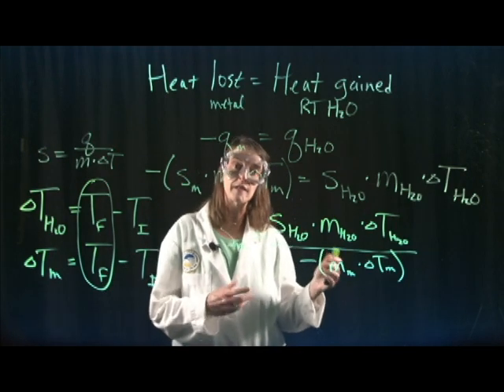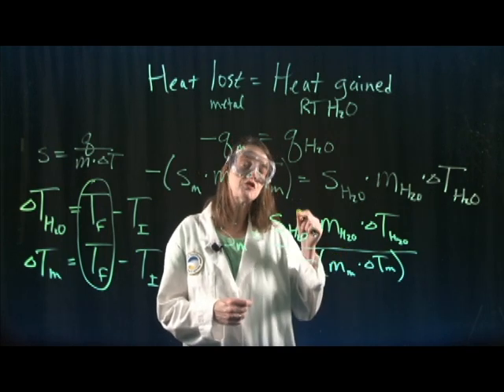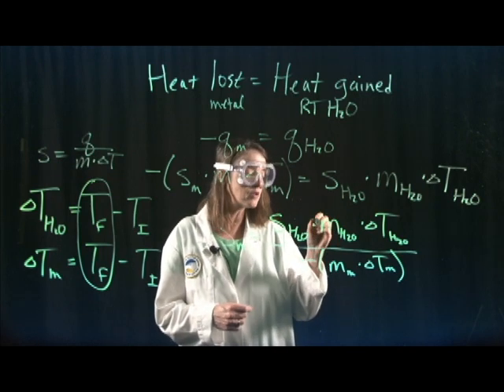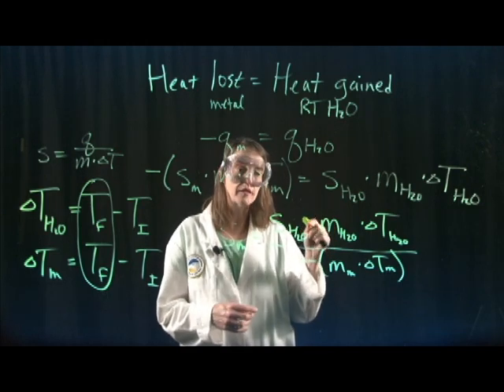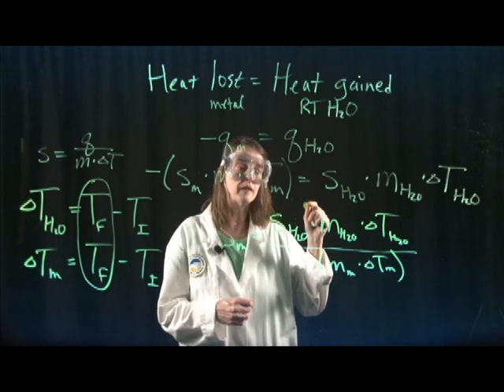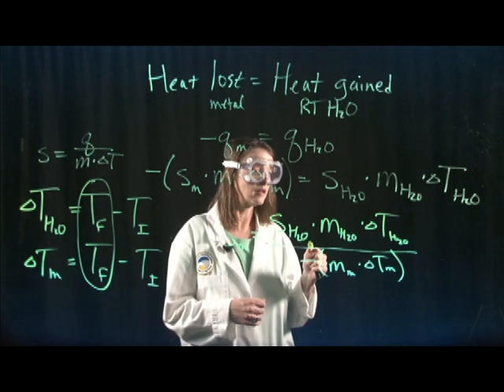After that, you'll want to set up the LabQuest probe with the temperature probe. Be sure to select the program that's on the SD card. If you don't see the little SD symbol on your LabQuest probe, let one of the assistants know. Sometimes the card isn't seated properly or something needs to be done about that. But make sure you get the experiment off of the SD card.